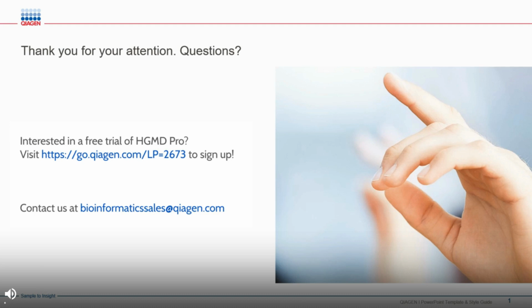Okay. We have some time left to take a few more questions. Next one, which genome build is used for HGMD? So HGMD has been updated for HG38, and most of the information is presented that way. However, there is still support for HG19 so that you can also see that information if that's the build you're using. Okay.